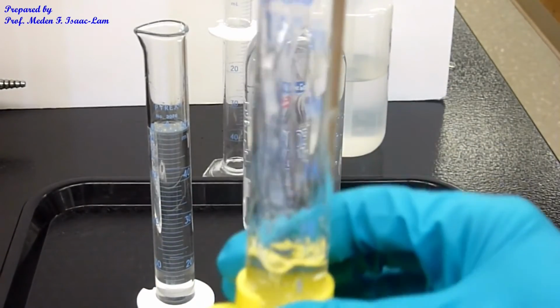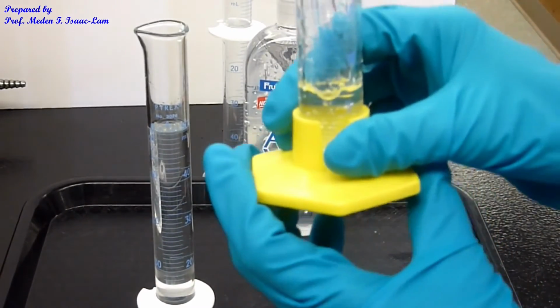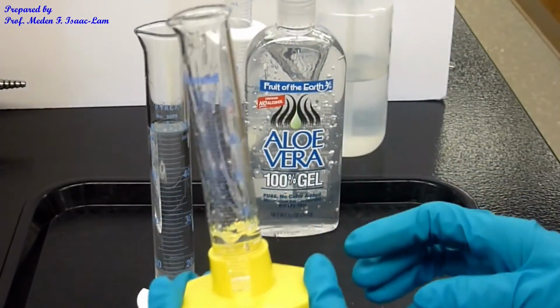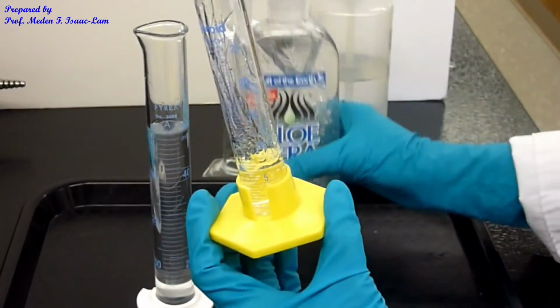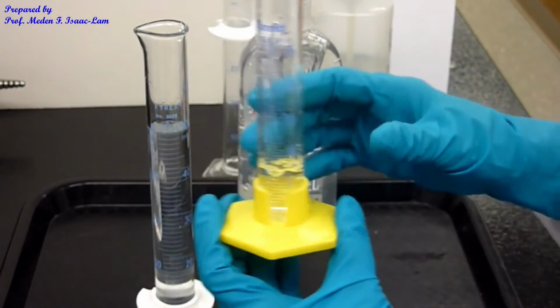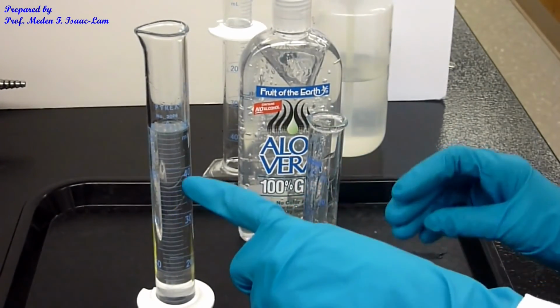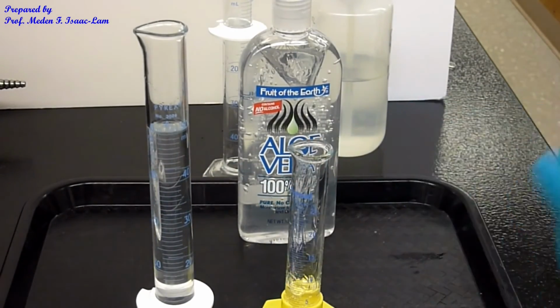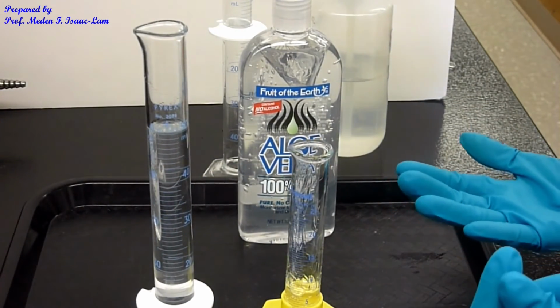Okay, so approximately 7 ml of the gel. Coming from here, I basically just pour it like that. And then we're going to take 43 ml of this solution and mix it together. That's going to be our hand sanitizer.